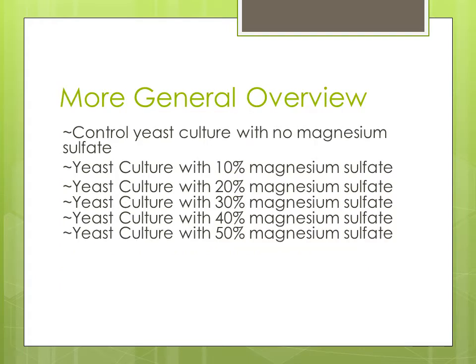We created a control yeast culture with no magnesium sulfate, a yeast culture with 10% magnesium sulfate, a yeast culture with 20% magnesium sulfate, a yeast culture with 30% magnesium sulfate, a yeast culture with 40% magnesium sulfate, and a yeast culture with 50% magnesium sulfate.